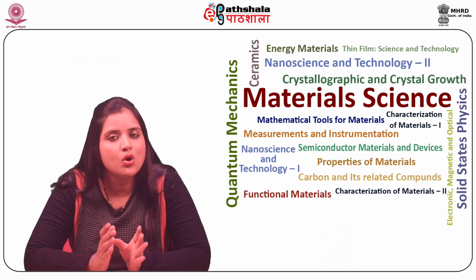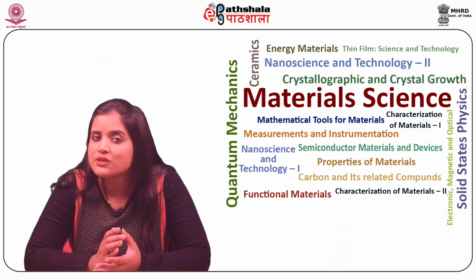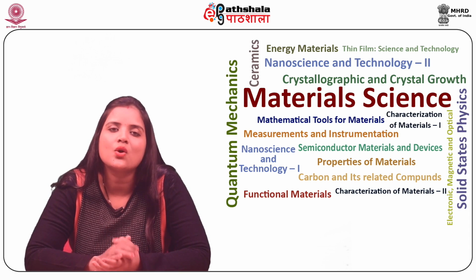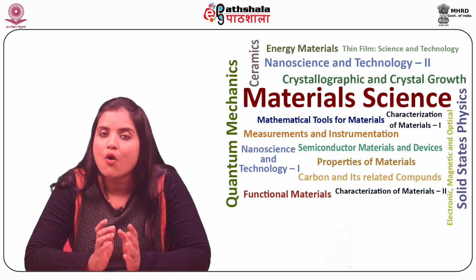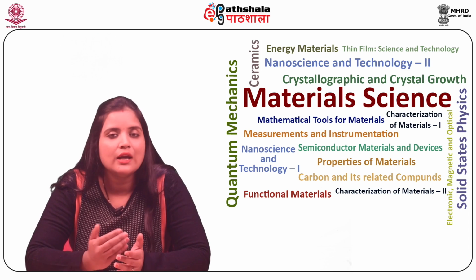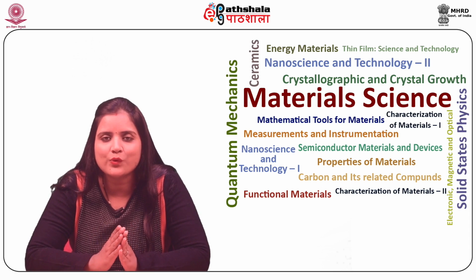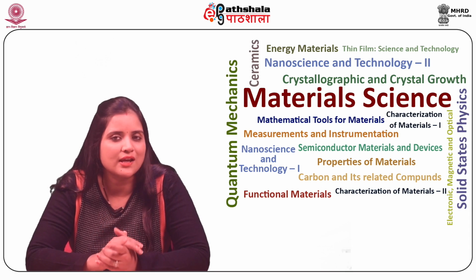The term hologram has since entered the vernacular. That is, film-based holography has been used in myriad applications over the decades. The developments of affordable, high-resolution and high-speed digital cameras, along with increased computer processing abilities, have seen holography enter a new phase over the last 2 decades.